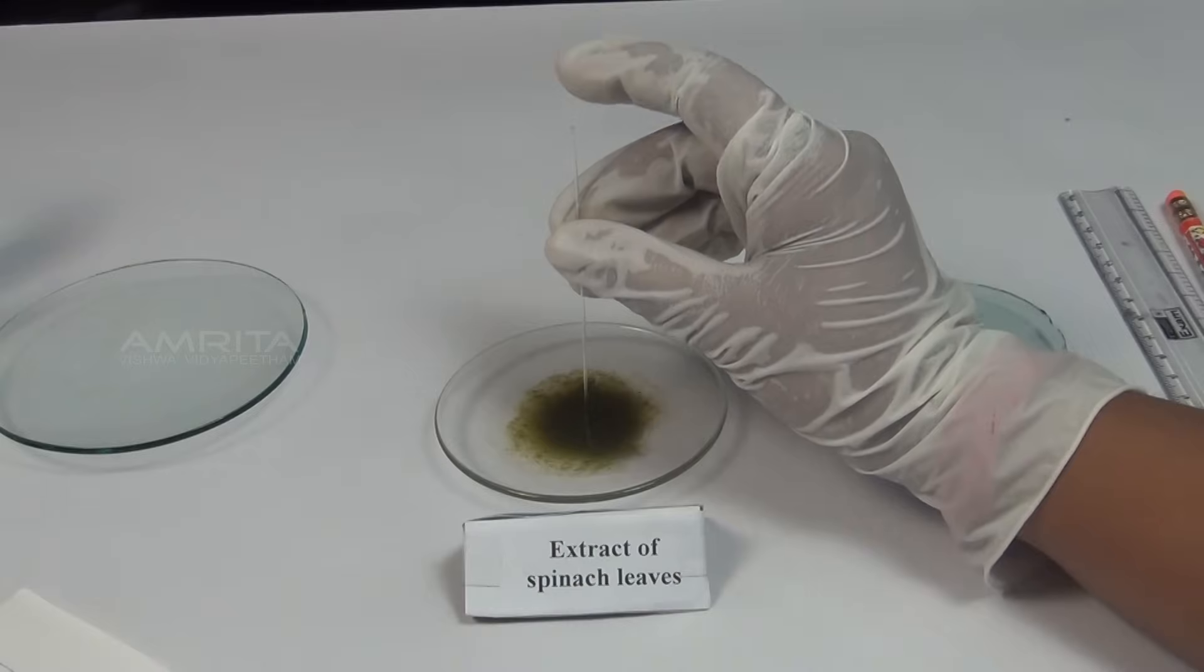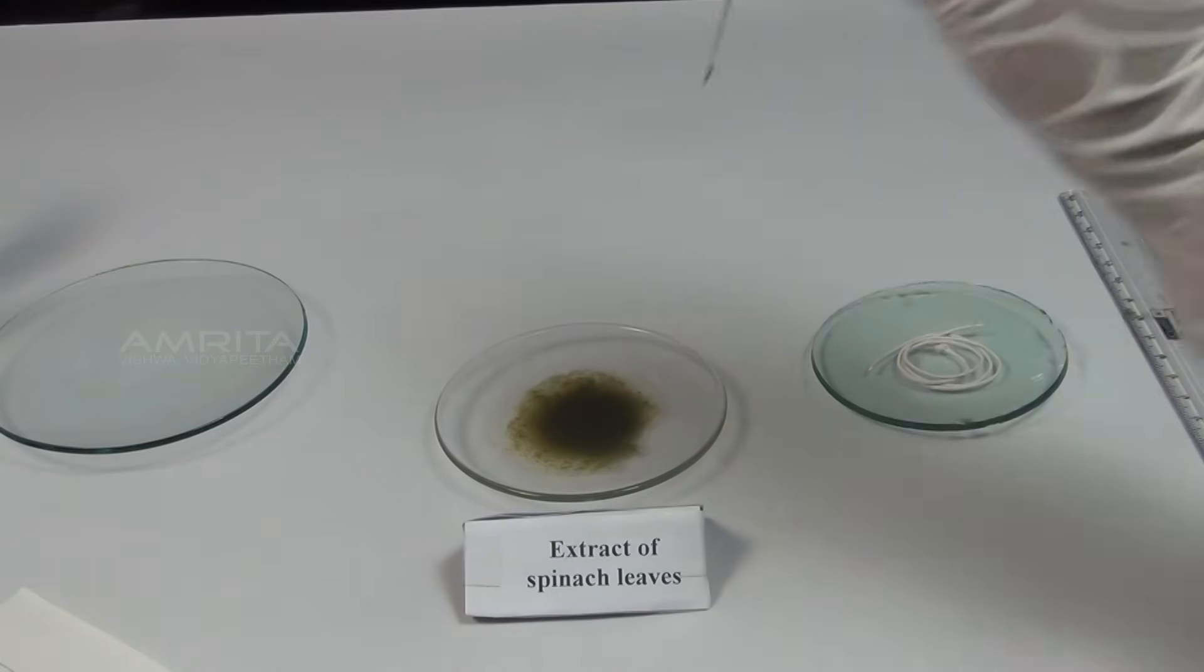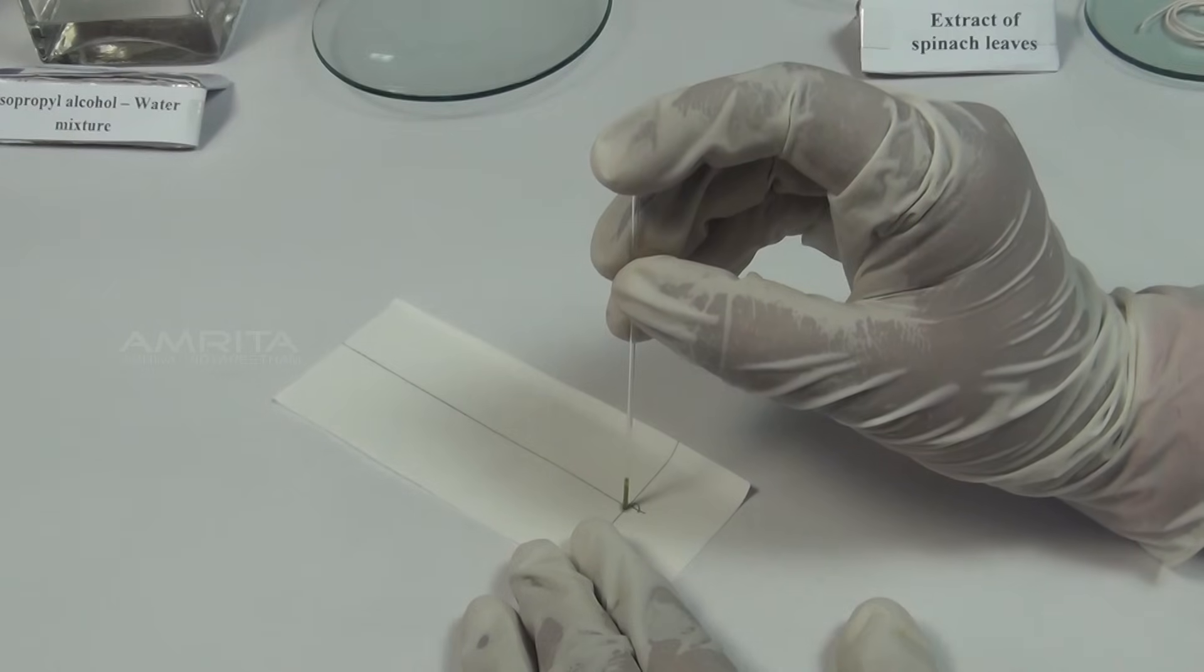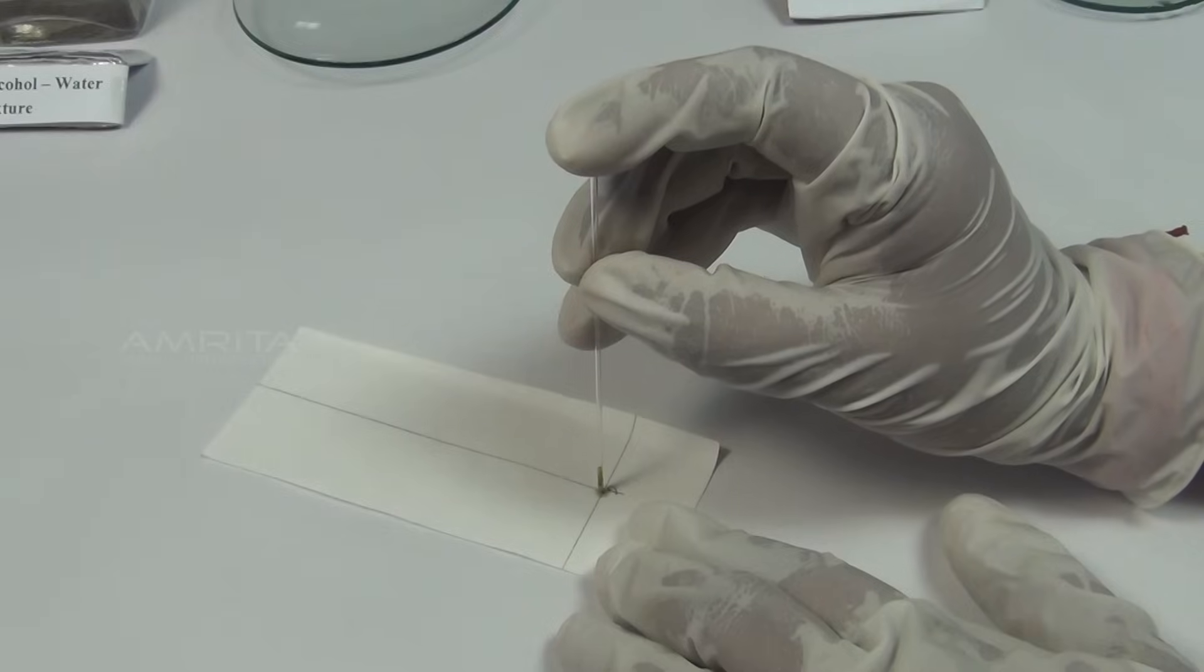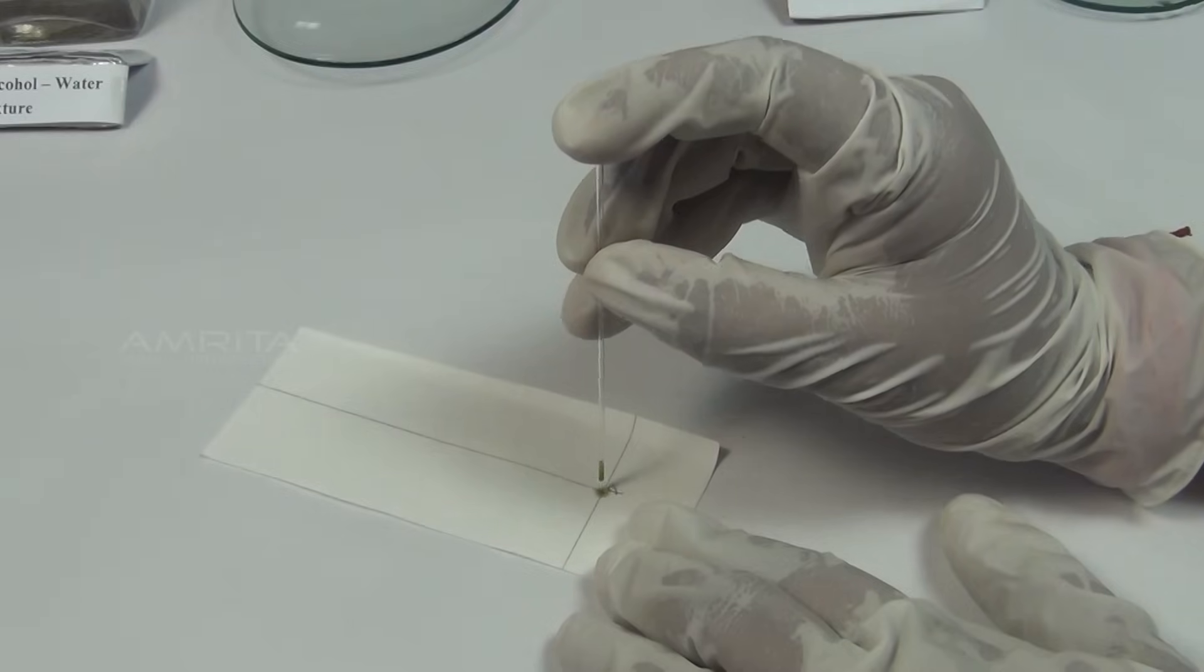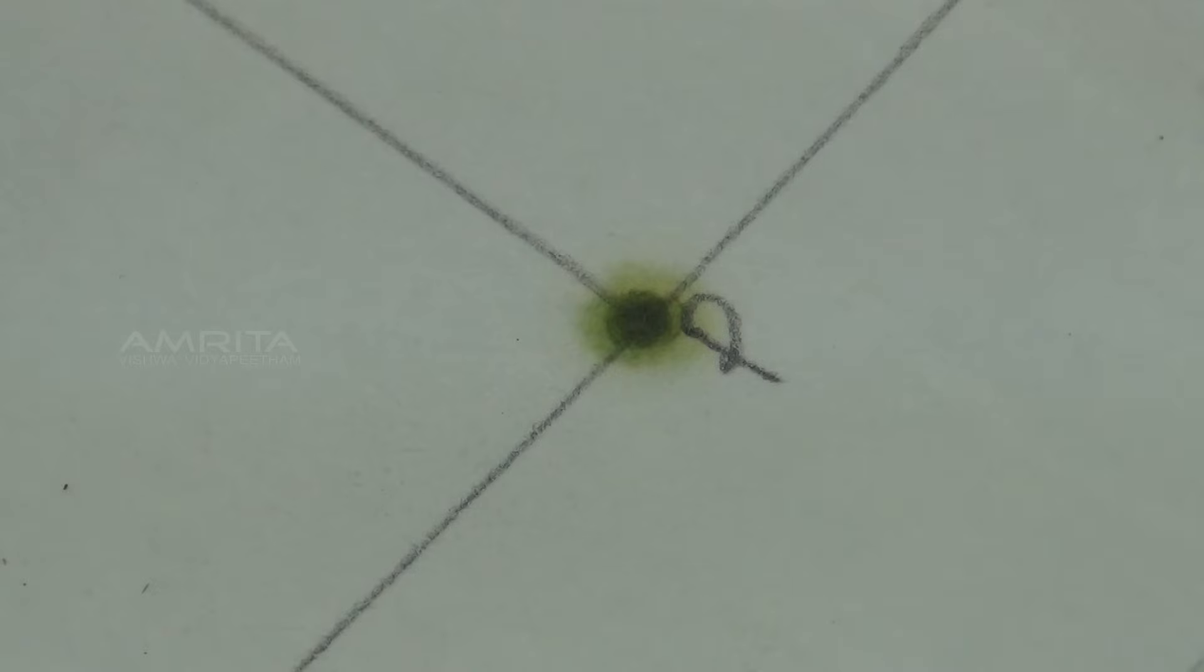Take the extract of spinach leaves using a capillary tube. Put a drop of the leaf extract at point P. Allow it to dry in open air. Put another drop on the same spot and dry again so that the spot is rich with the mixture.